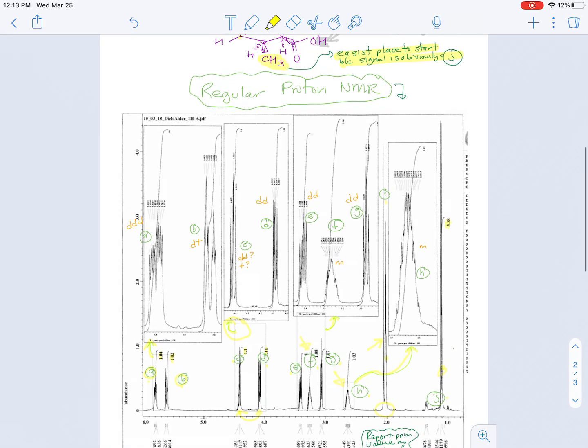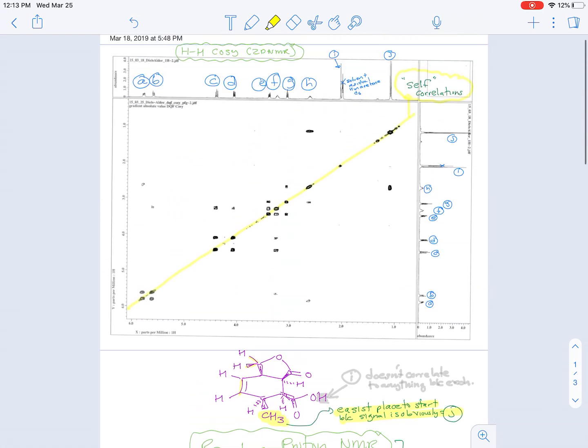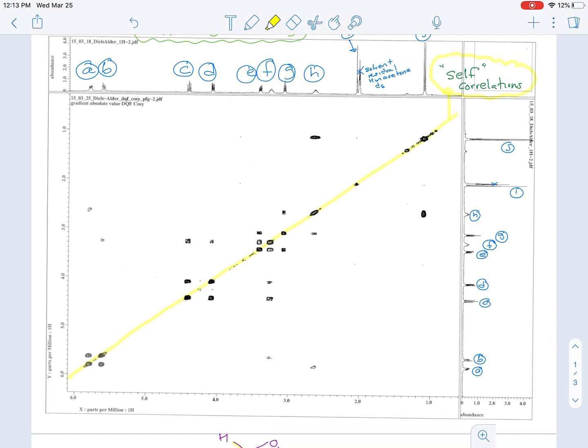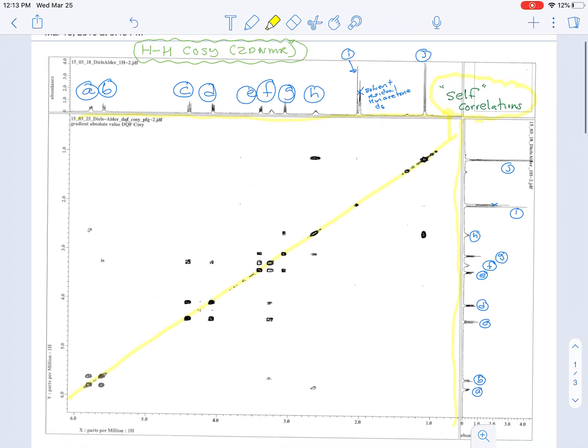So when we look at the COSY spectrum, this is a two-dimensional NMR, proton-proton COSY, and it's called two-dimensional NMR because you plot the two spectra on two axes. And again, I've pre-lettered the signals.